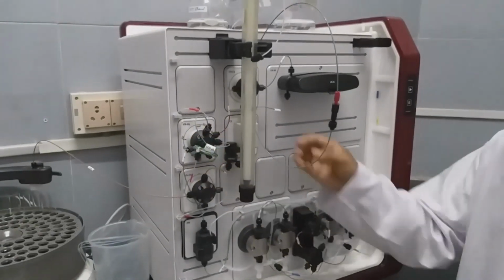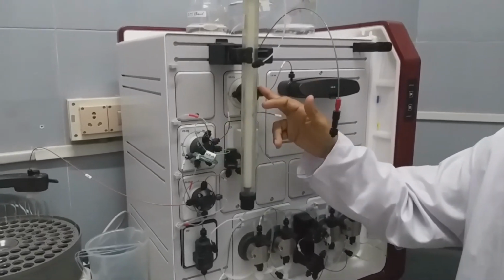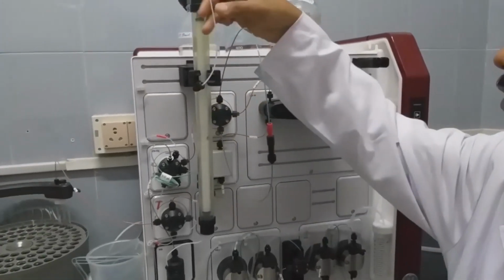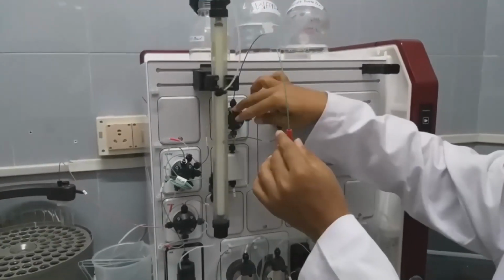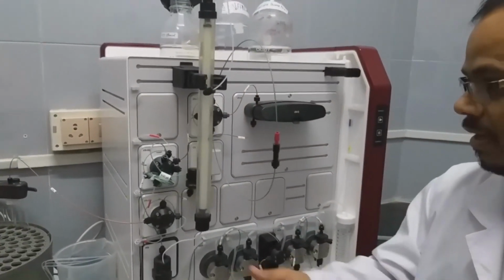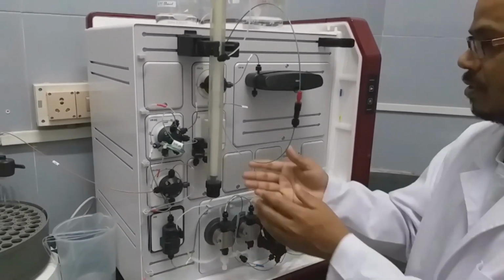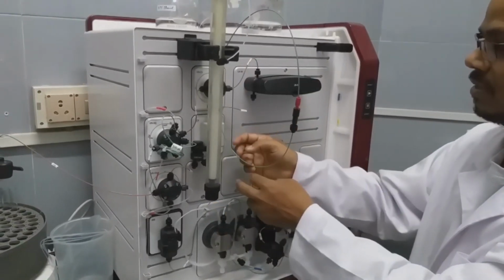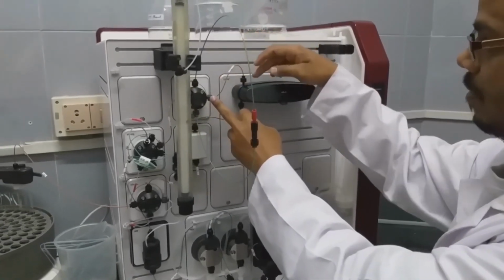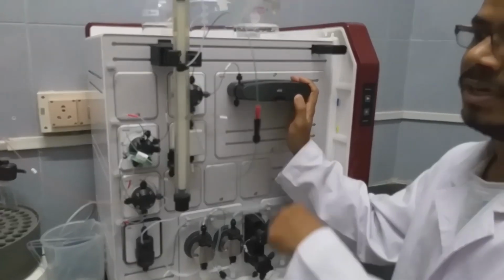Once the mixing is done, it will go directly to the inlet loop. Once it enters the inlet loop, it will go to this chamber where it can be connected to the column. The top portion of the column will connect here. We will show you how to connect the column in a coming video. After that, whatever comes out will enter here and go directly into the UV chamber where the eluted component will be detected.